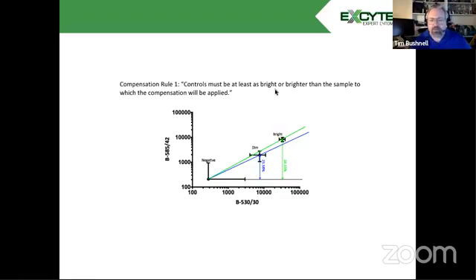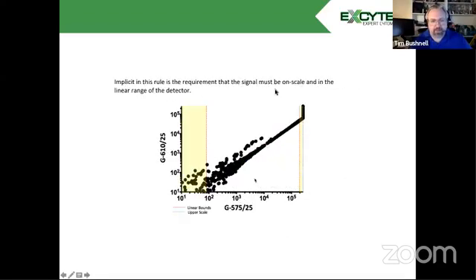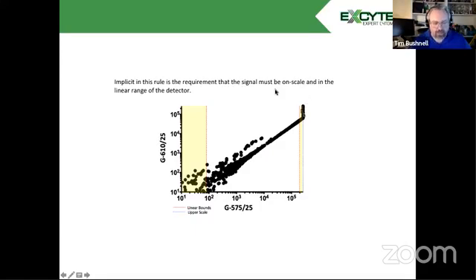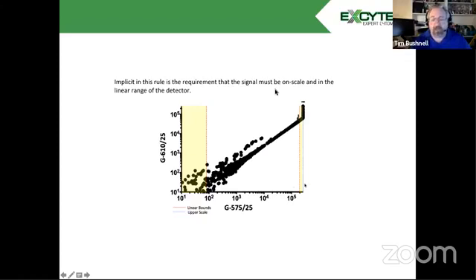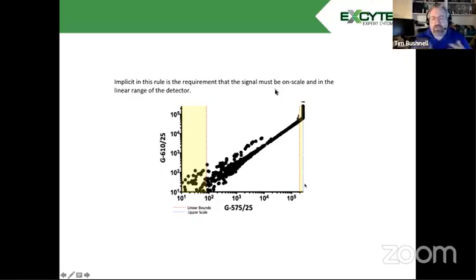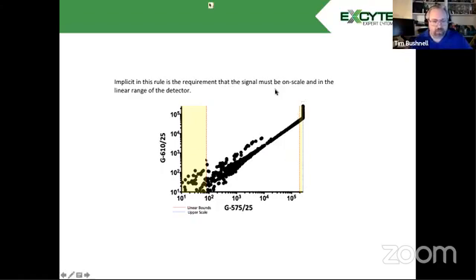Second, implicit in that rule is that the signal must be on scale. So there's going to be a scale that we have that our detectors measure. And you can see here, these events are off scale, so we can't use them. It has to be within the linear range of our PMT. If we're outside of that linear dynamic range, compensation is no longer valid. So you can see here, I've marked the linear range. So we would want our compensation values within this range, but bounded by the red lines.